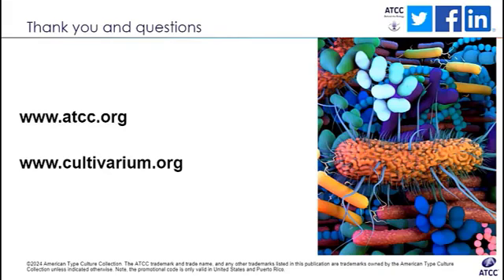Do you have standard promoters and RBS parts that you can use across multiple bacterial species? That is a really good question. Yes, we have a library of parts that includes ORI, markers, ribosome binding sequences, and promoters that we can use across different species. Again, you can find these toolkits on Addgene.